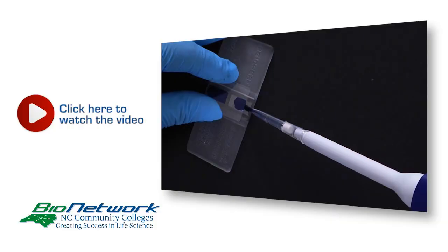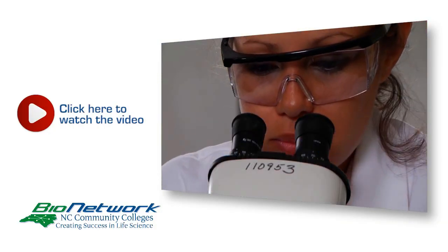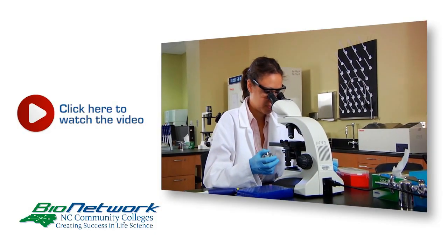Count the cells using a hemocytometer as seen here, or use an electronic cell counter. Click the link on your screen to watch a demonstration of these steps.